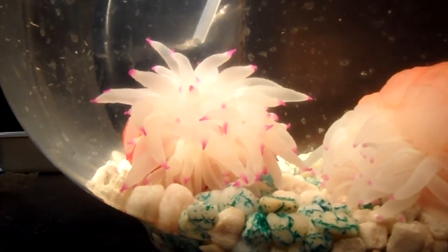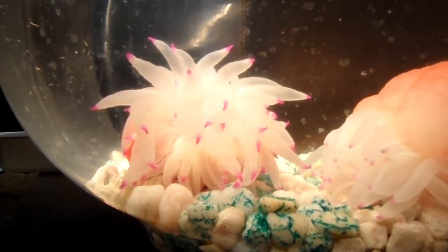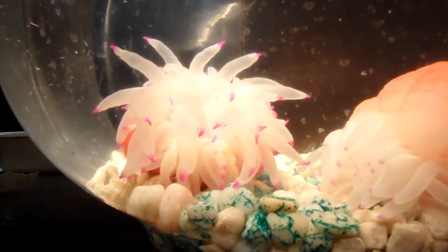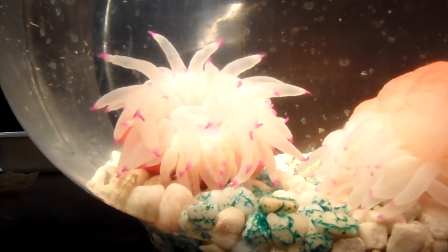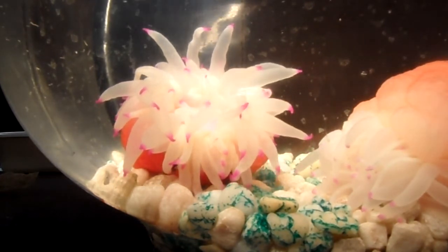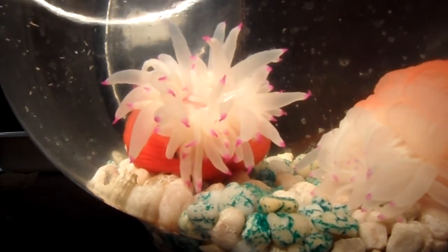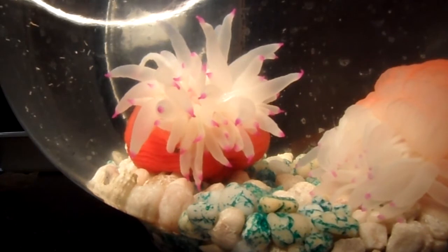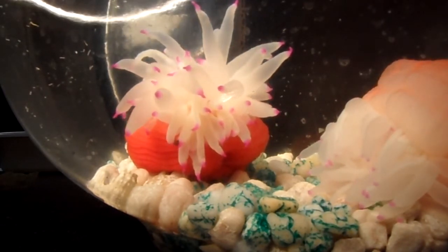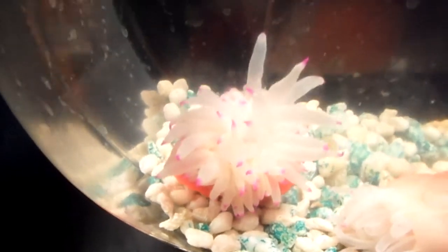And now I'm going to apply the vinegar again and see what happens. A little bit more this time. Oh. Oh, there's a reaction. Few tentacles. That is, if you want to interpret that as a reaction to the vinegar. Put the light on top again.